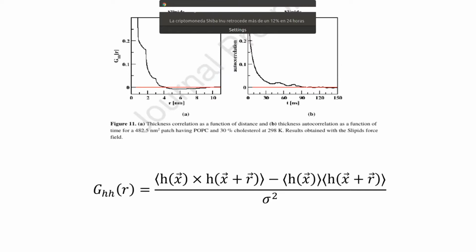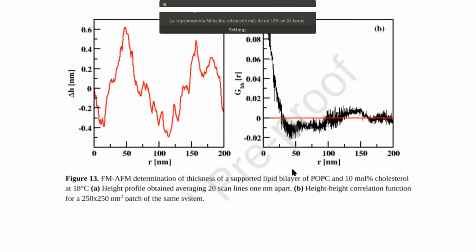I mean, you are getting parts of the membrane where this correlation of the structures is different. These domains were clearer in the color images, but this is more rigorous statistically.